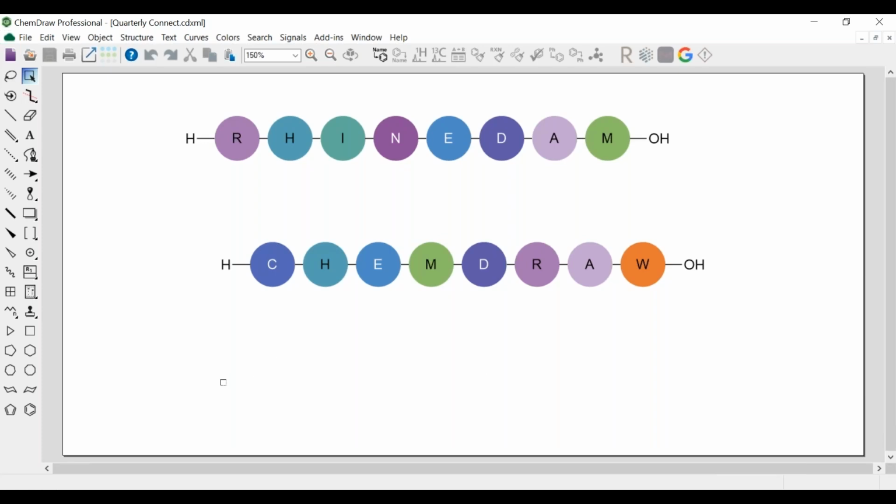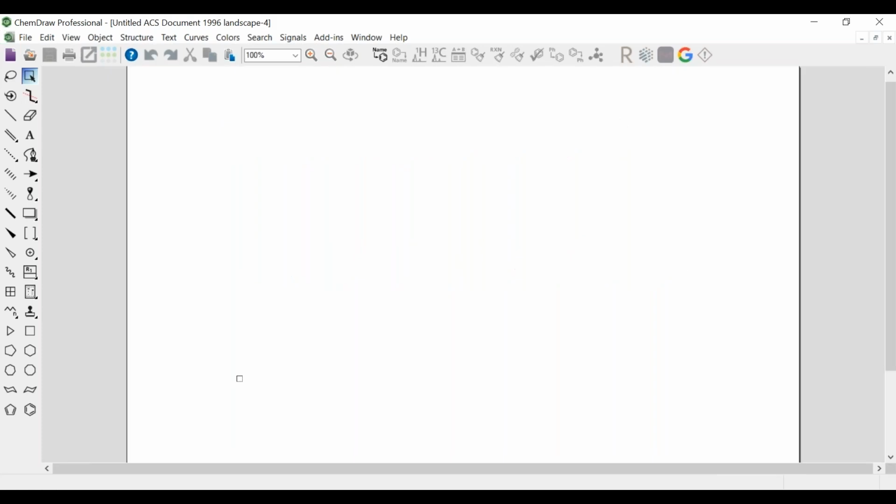Now, continuing in this vein, let's talk about pasting the oligonucleotides, because peptides are a different thing. Oligonucleotides add in a bit of complexity in that you have a lot of things to consider, like the backbone, the ribose sugar, right? The phosphates and things like that.